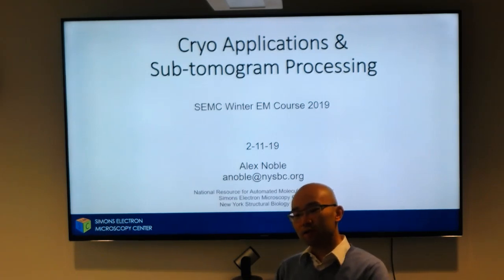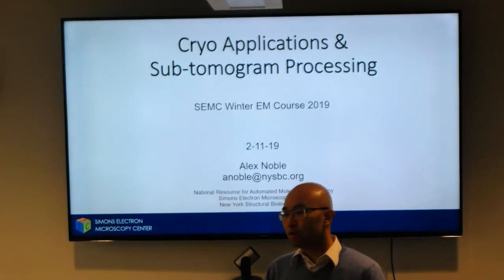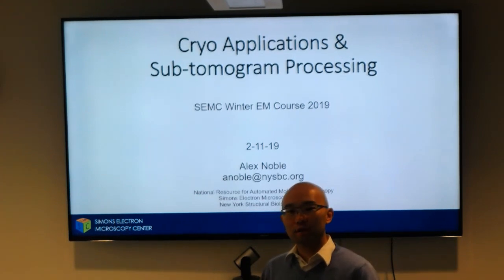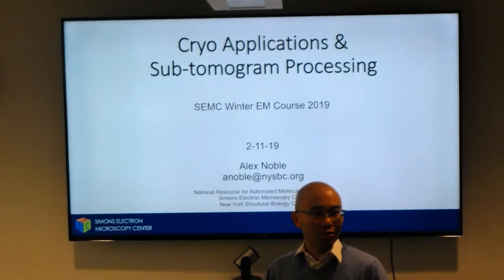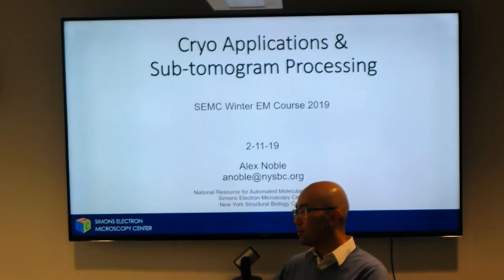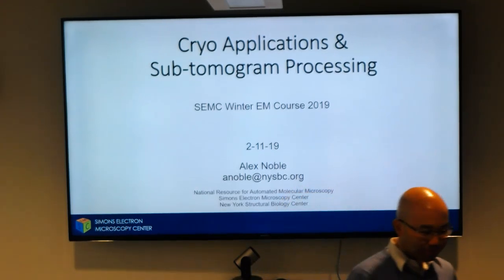And something that's really special is that on the fly with data collection, within half an hour of a normal data collection, you can get an initial tomogram out of that, and that's been very informative for that. So the recommendation for everyone here is take a tomogram. Even if you're doing single particle, it's always worth doing a tomogram. So Alex Noble. Cool, thank you, Ed.